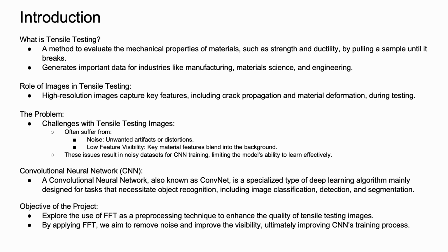Tensile testing is a critical method used to evaluate the mechanical properties of materials such as their strength and ductility. During this test, a sample is pulled until it breaks, revealing valuable insights for industries like manufacturing, material science, and engineering.